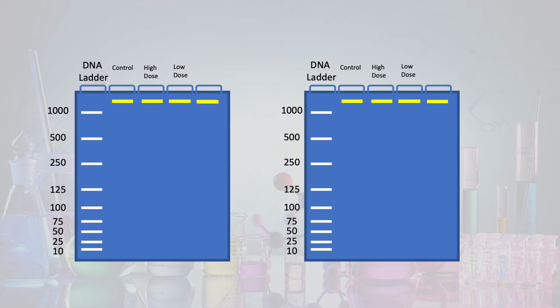All right, so now we're on to our last week of our PCR section. In our last week, we're going to be performing gel electrophoresis on our DNA samples that we generated in the previous week. So these are meant to represent gels for gel electrophoresis again, and these are wells in our gels. So in each well, a different treatment group is going to go.